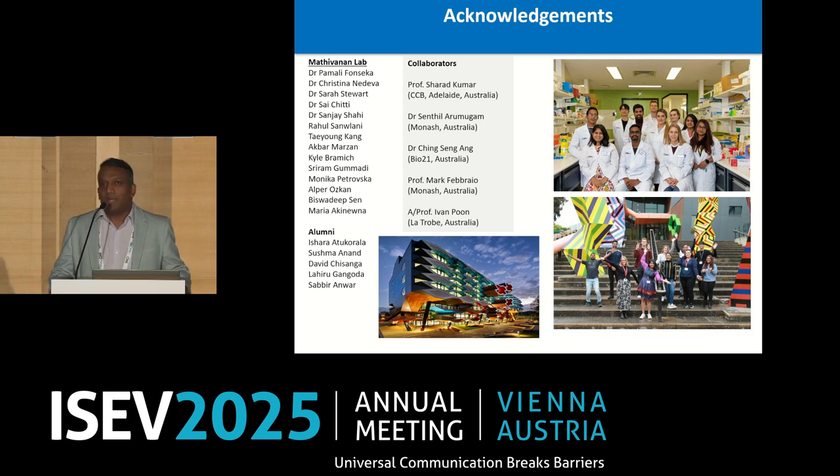Yes. So in such a scenario, you can probably separate by the isolation protocol. However, I agree with you. There's a lot of bad quality data sets out there because, as a field, we have evolved in what we call exosomes. Probably 10 years ago, now in Exocarta, we are deleting some of those data sets and trying to incorporate them. But having said that, it's a very hard thing to do if you're trying to obtain high quality data from publicly available sources, which you may need to probably annotate yourself.